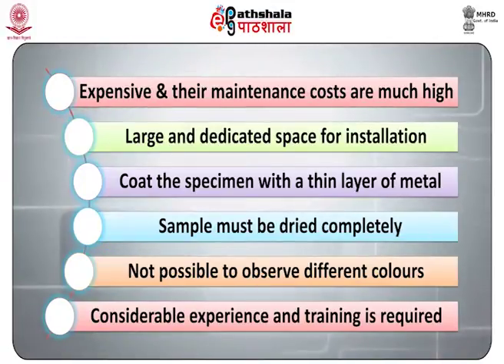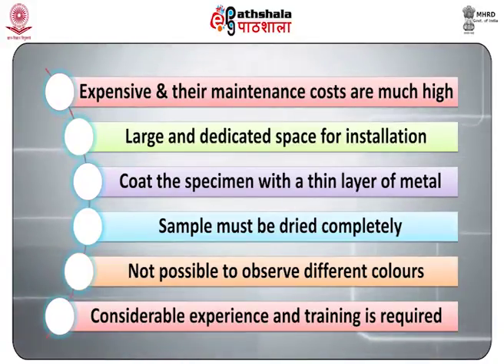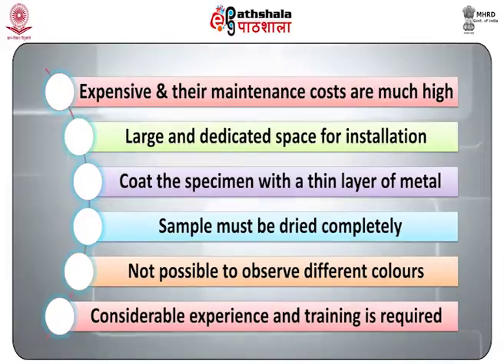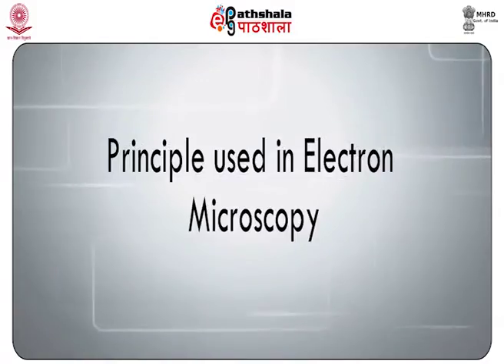Also, it is not possible to observe different colors in an electron microscope. Considerable experience and training is required for experts to identify artifacts.